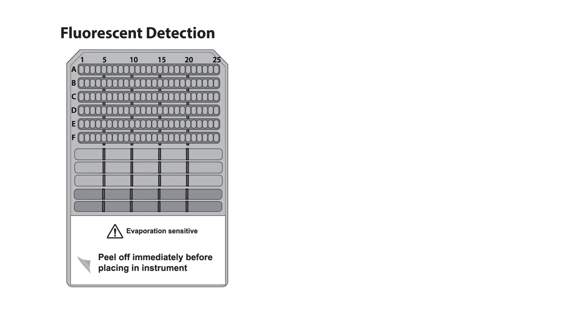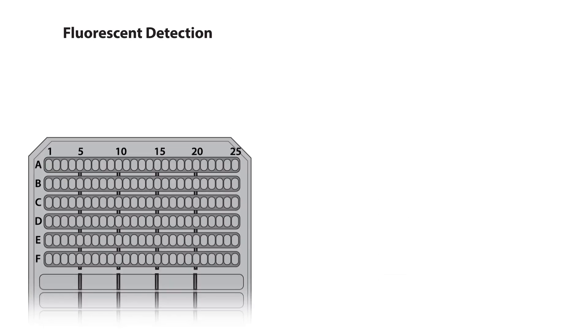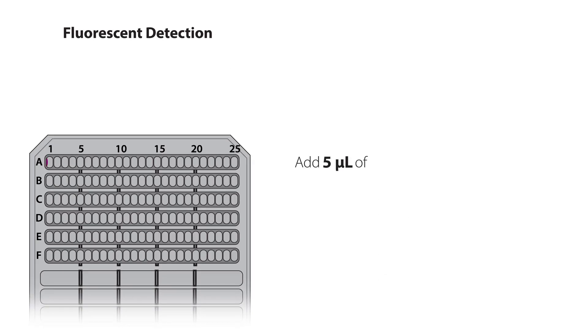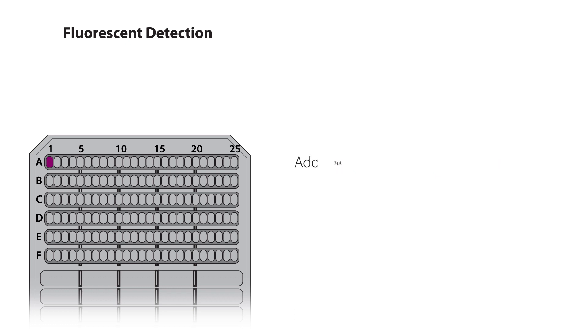For fluorescent detection, add 5 microliters of biotinylated ladder and 3 microliters of prepared samples.